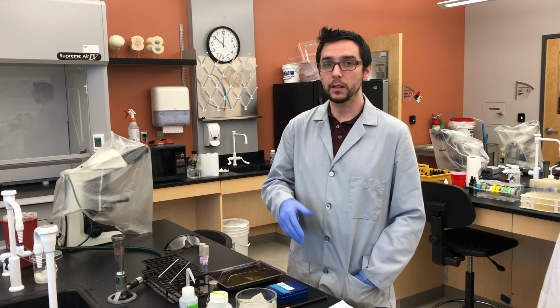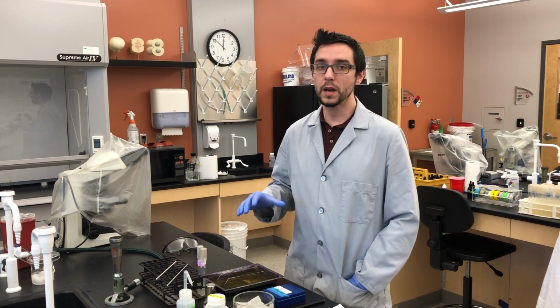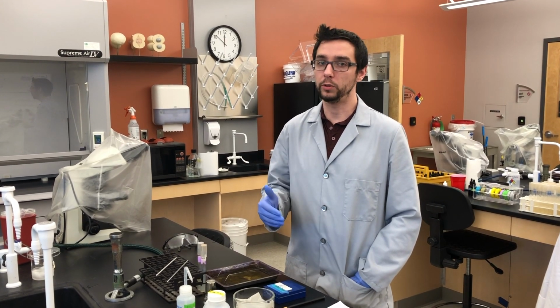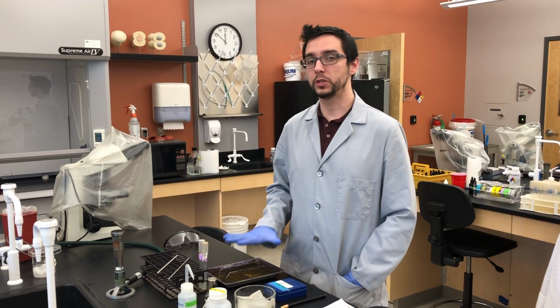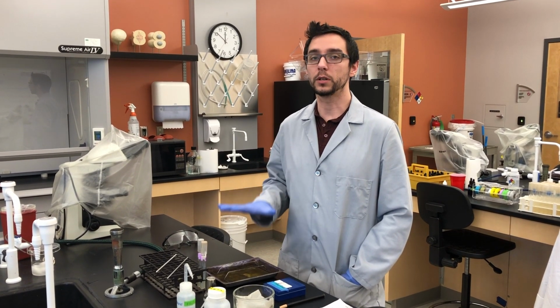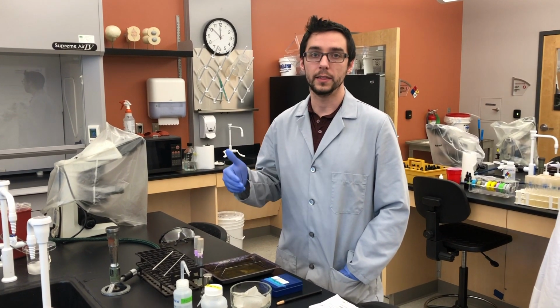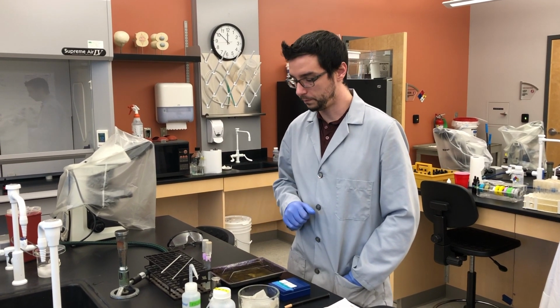Even though they are technically gram-positive based on their cell wall structure, they do not soak up much of the crystal violet and they end up showing very faint purple if dyed at all. So this differential stain is designed to circumvent that mycolic acid so that we can actually visualize these specific types of bacteria under the microscope.